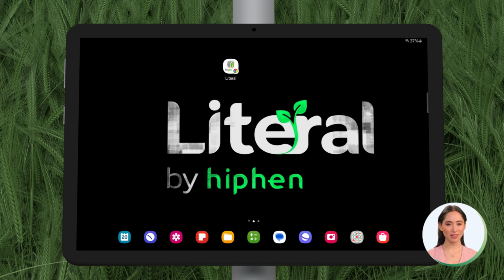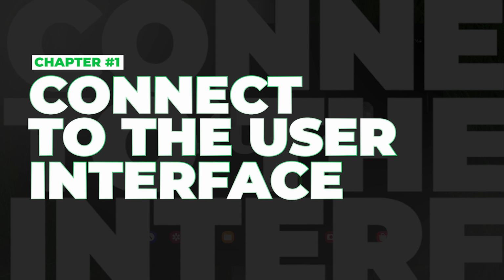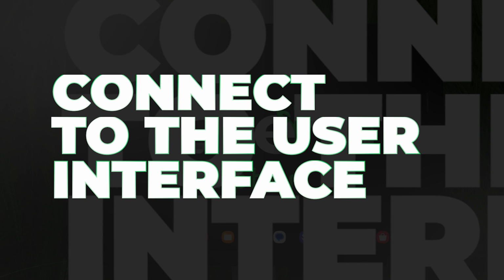The Literal User Interface tutorial. For the next few minutes, I will walk you through the essential steps for setting up and executing a phenotyping mission using your Literal device.